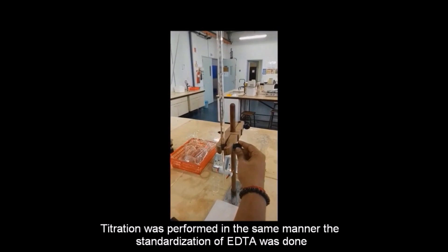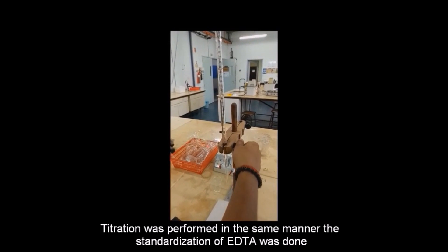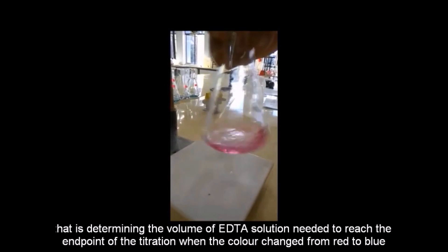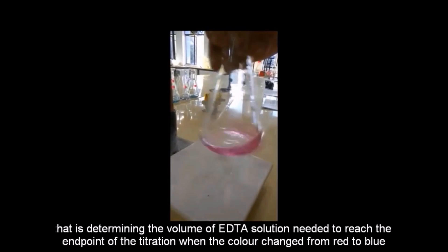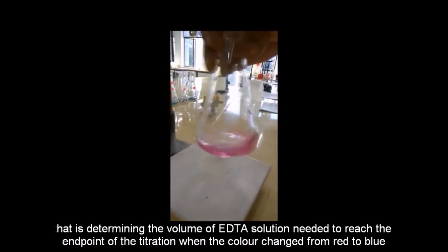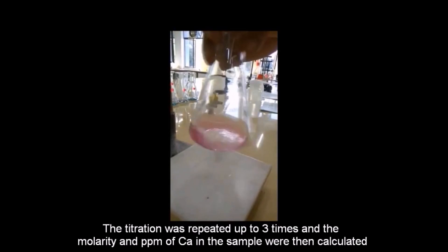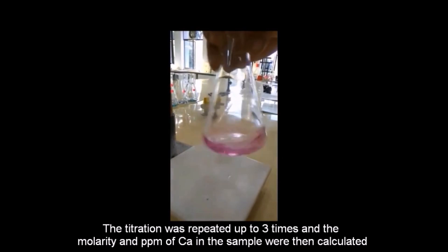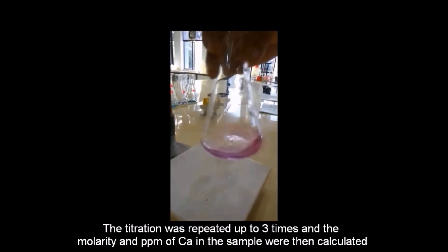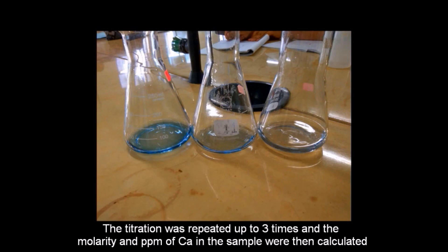Titration was performed in the same manner the standardization of EDTA was done, that is determining the volume of EDTA solution needed to reach the endpoint of the titration, when the color changed from red to blue. The titration was repeated up to three times, and the molarity and parts per million of calcium in the sample were then calculated.